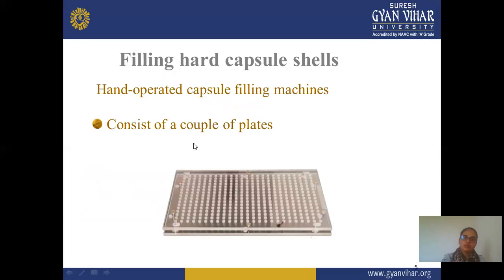And in filling the hard capsule shell, there is the hand operated capsule filling machine. It is a machine, or you can say an instrument, a hand operated machine, which is used for filling capsules on a lab scale or very small scale.